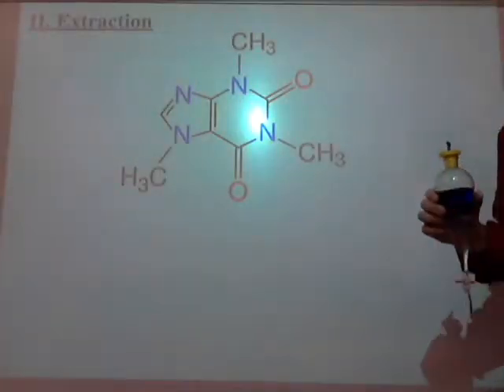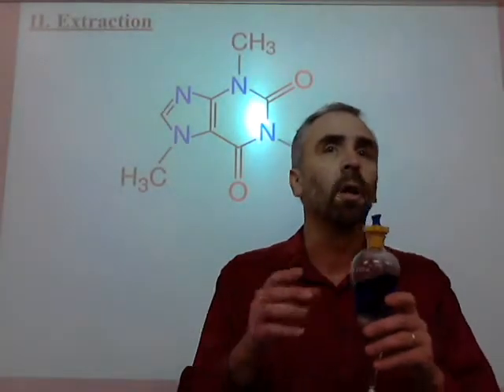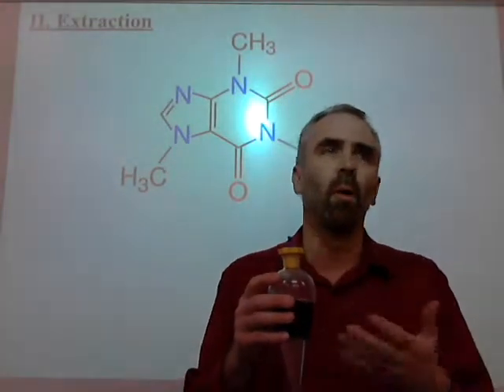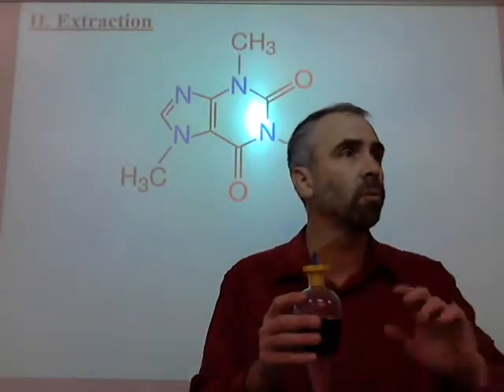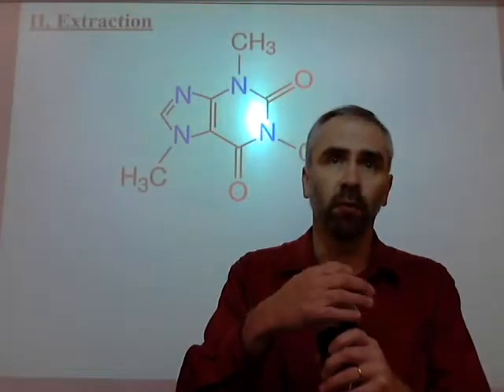When you go to do this tomorrow, here's what you're going to do. You're going to have your soda, basically, and water and ammonia, a couple of things in there, and you're going to pour it in here, and you're going to add some chloroform to it. You put your hands over the top. Make sure this lid's on nice and tight.